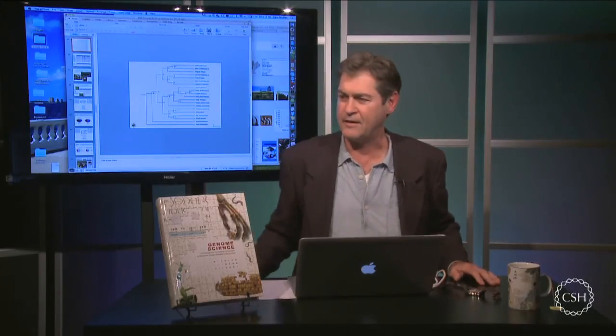If you have a question, you could just type it into the chat area there. I'm sure it was perfectly clear, everything I went through. A few people are typing, so I hope we have some questions here. I'll read them off as I get them.